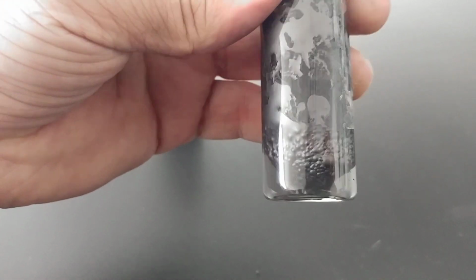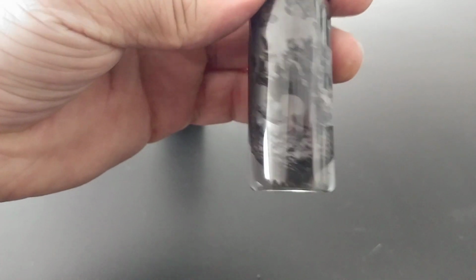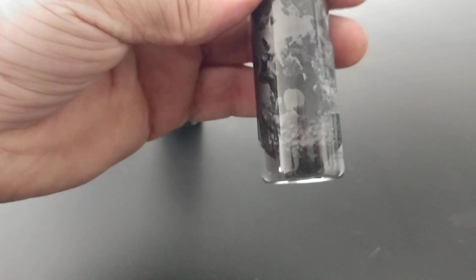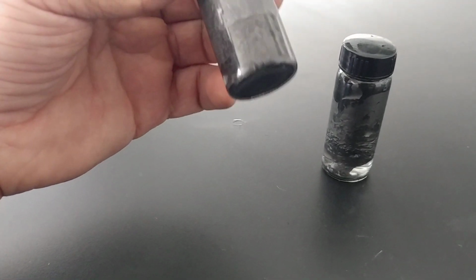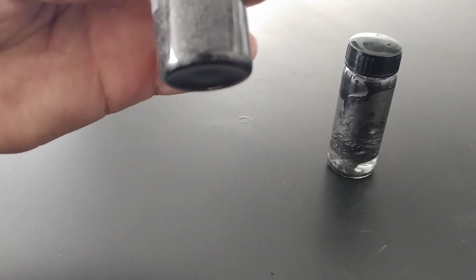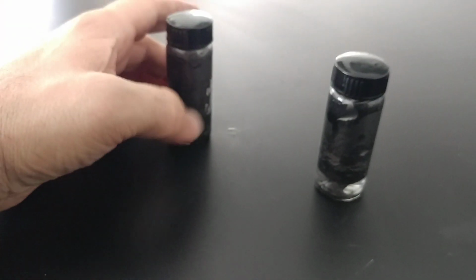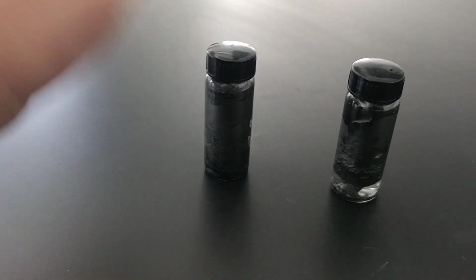I don't know if this translates as well on the camera as it does. I mean, it looks close, but it's not. I'm looking at the camera, and it's not as dramatic, but you will see that. And again, graphite will just mix all together, and it is what it is, and graphene will separate. The graphite, after a while, will settle down into the water. The graphene will never do that.